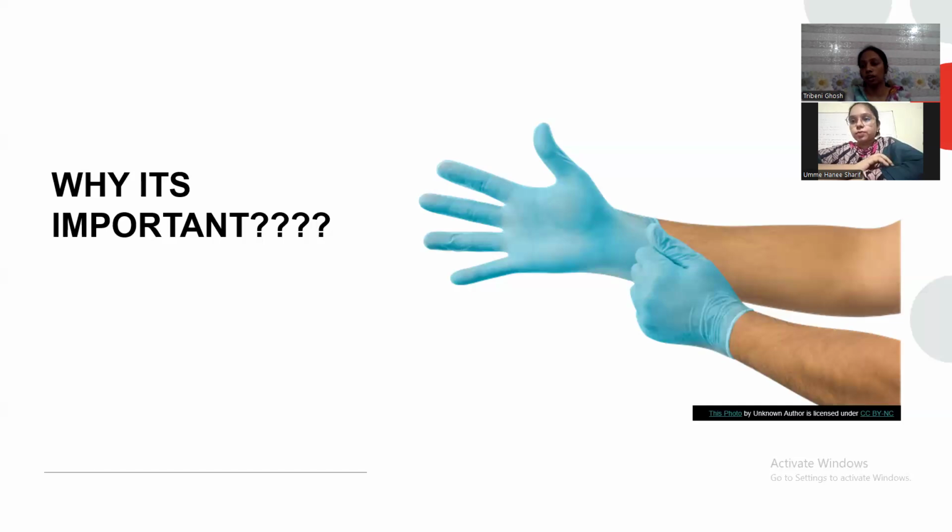You might be doing one patient's samples, and then you are taking another's samples, and cross contamination could happen in that case. So you have to wear hand gloves, and after doing one experiment, you have to discard those gloves, put on new gloves, and then do another experiment. That's how it works in the laboratory.